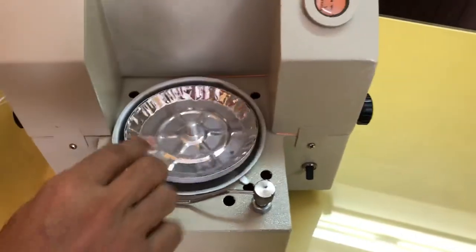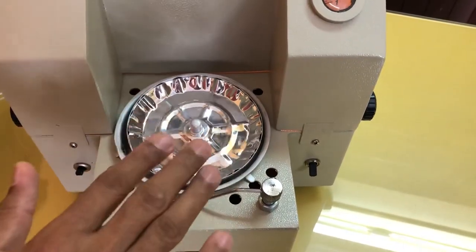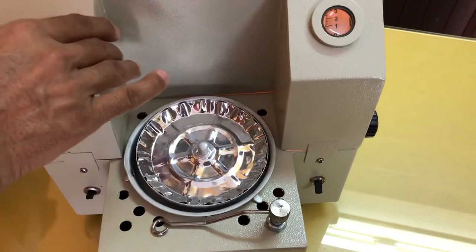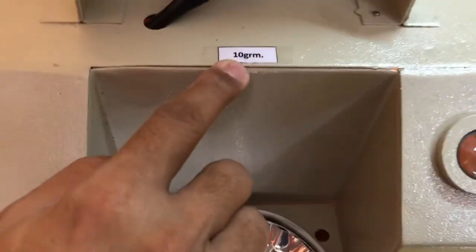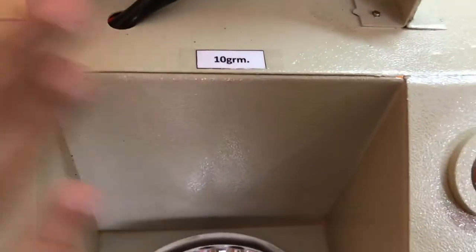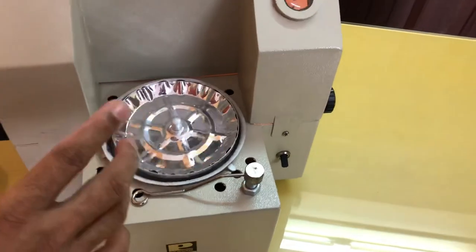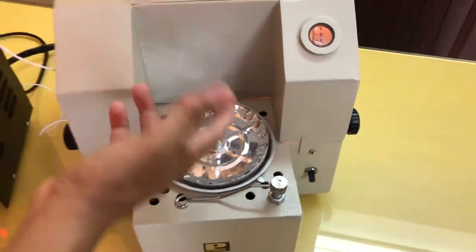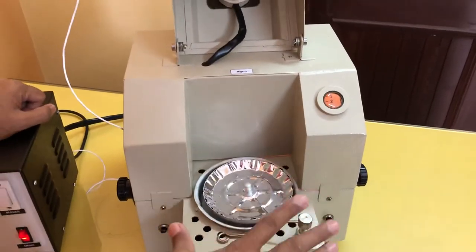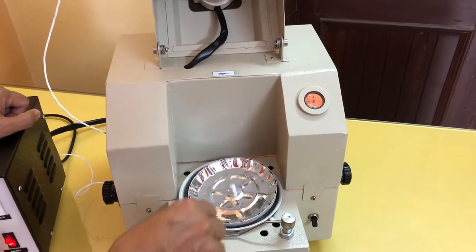One condition is to keep the sample distributed evenly. The second condition is we have to make a small layer of the sample, as thin as possible. Now the main thing is how much sample we have to keep on this sample pan — this instrument tells itself. As you can see, this is a 10-gram model, meaning approximately 10 grams of sample is required. The model capacity just informs you how much sample is used in a testing. If the sample is in powder form, it is best suited for this application. If it is hard, you have to crush it and then distribute it gradually.